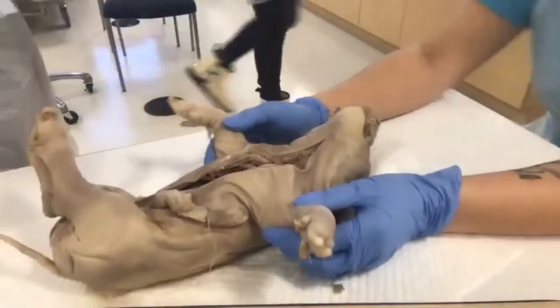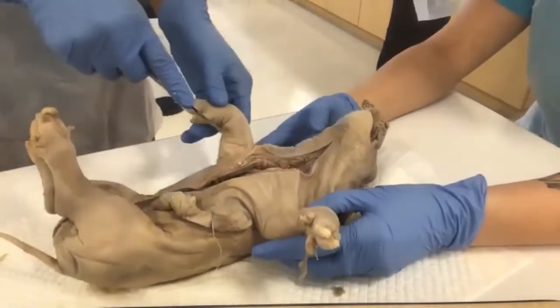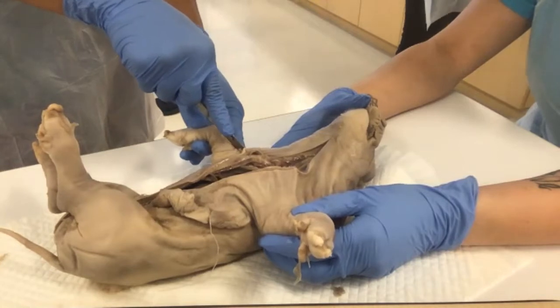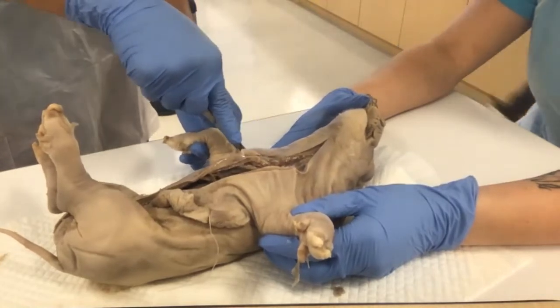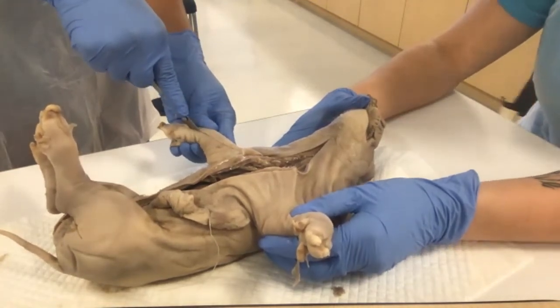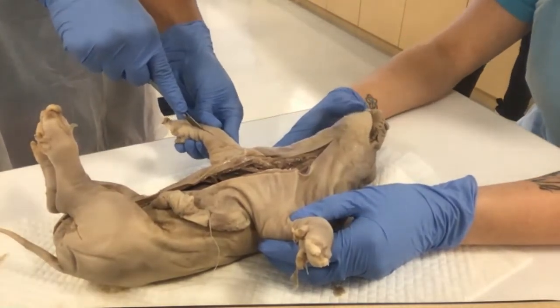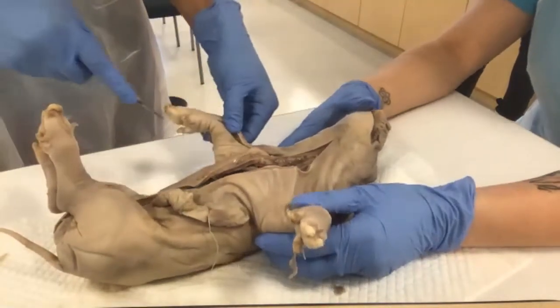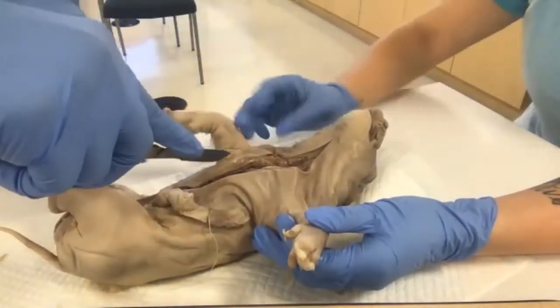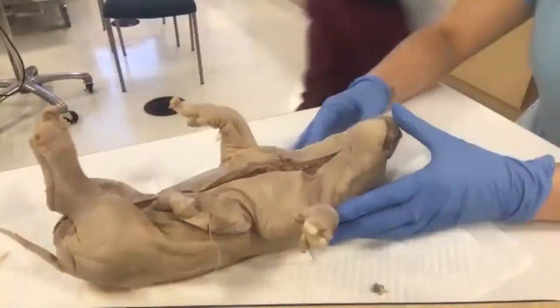Let me open up that, here, the arm. Let me open it up to that section. So, ladies, see how you open it up here, and then you can open up underneath the jaw, just like that. Now, since there are three of you, you guys are going to rotate. And for those of you looking for medium gloves, do you want to?